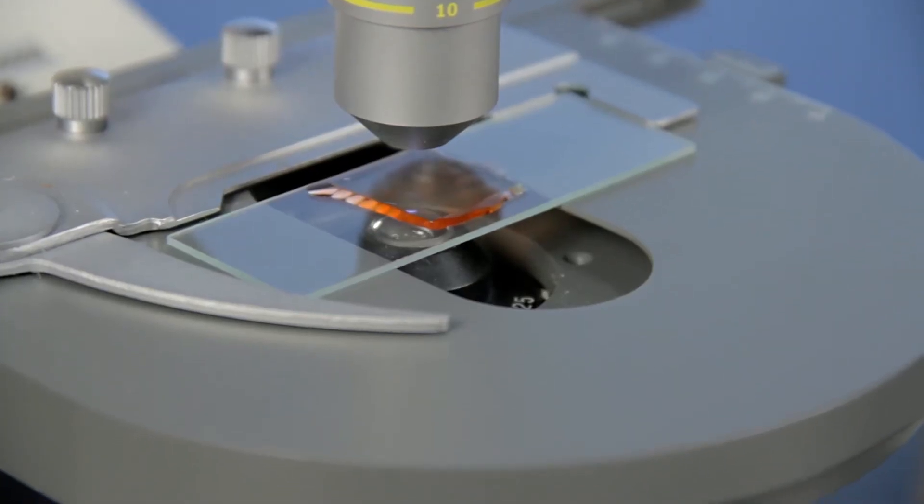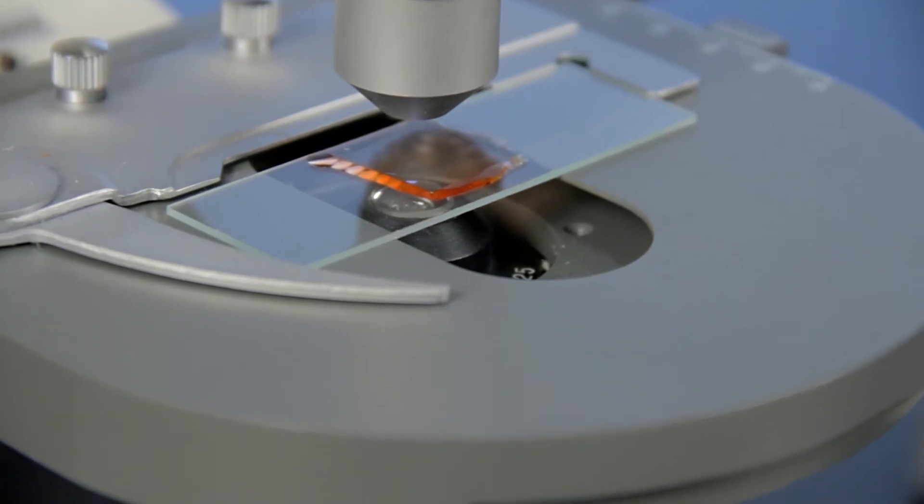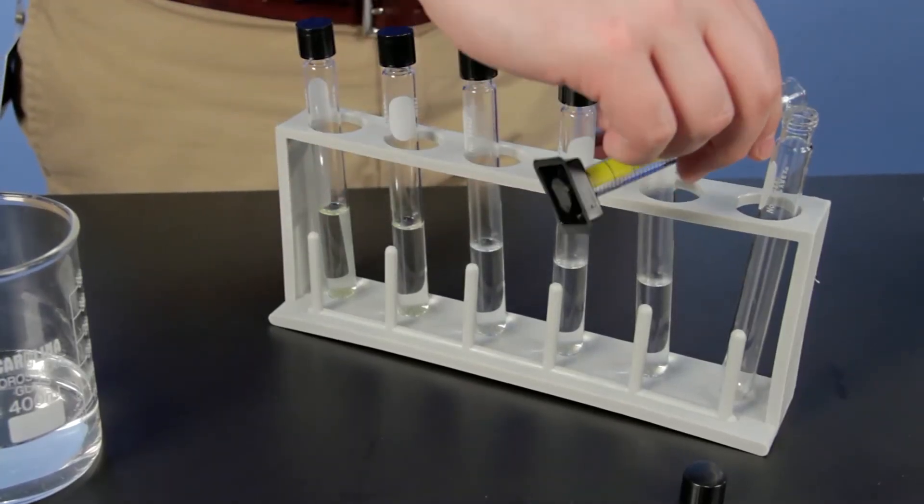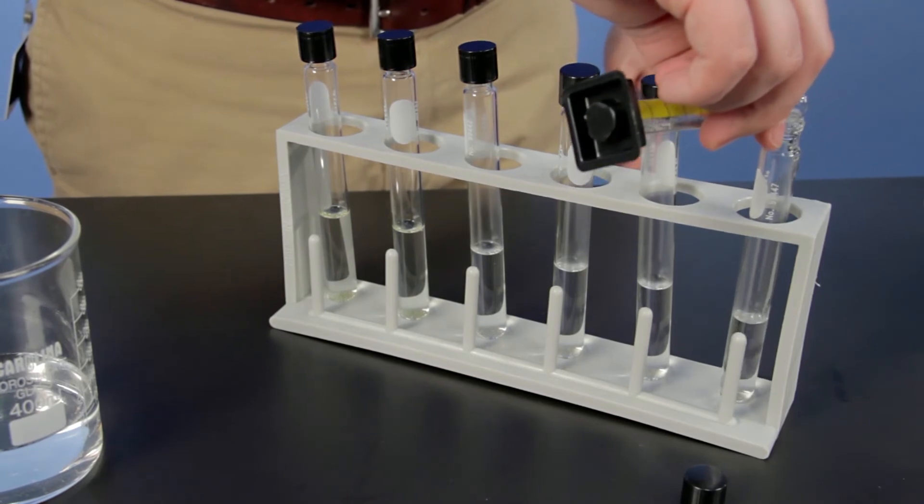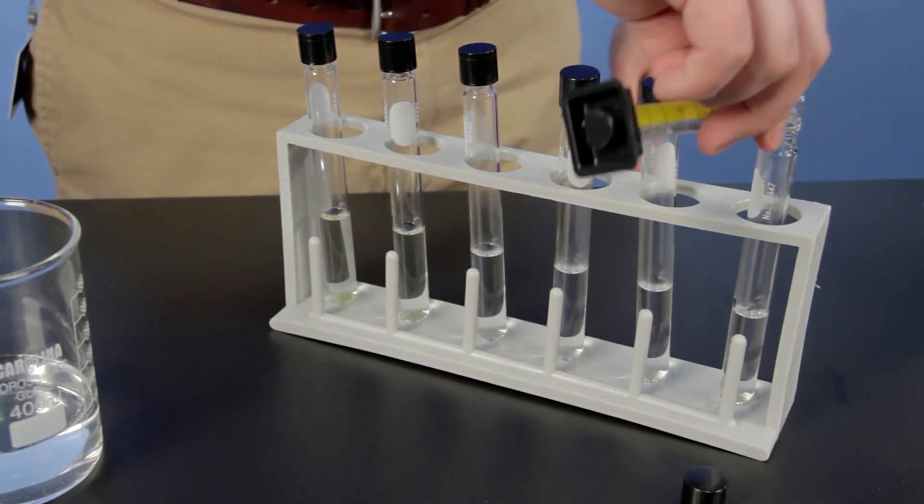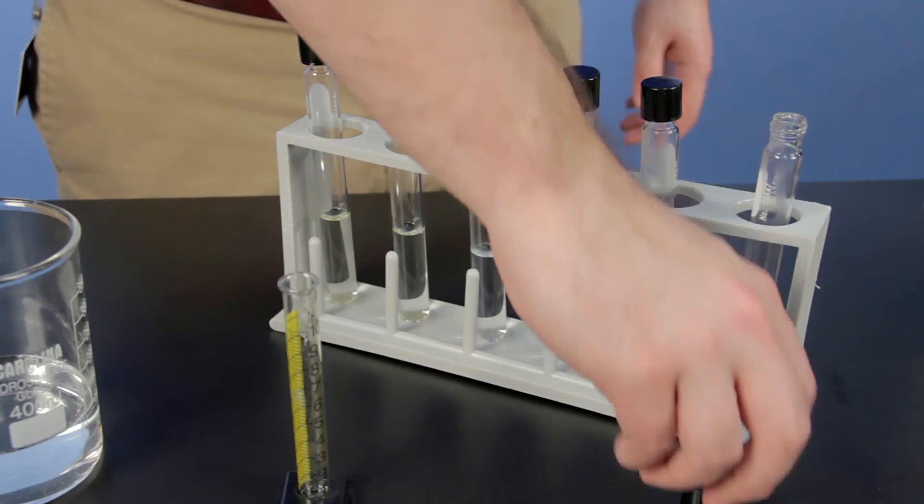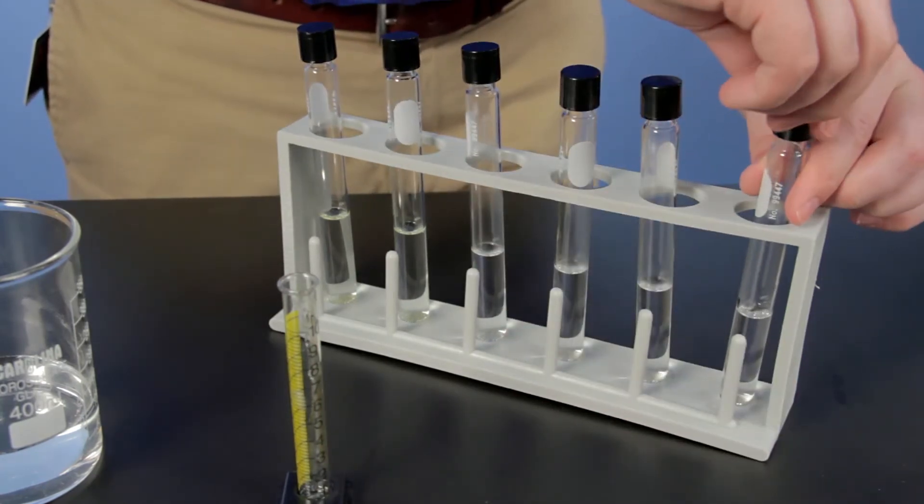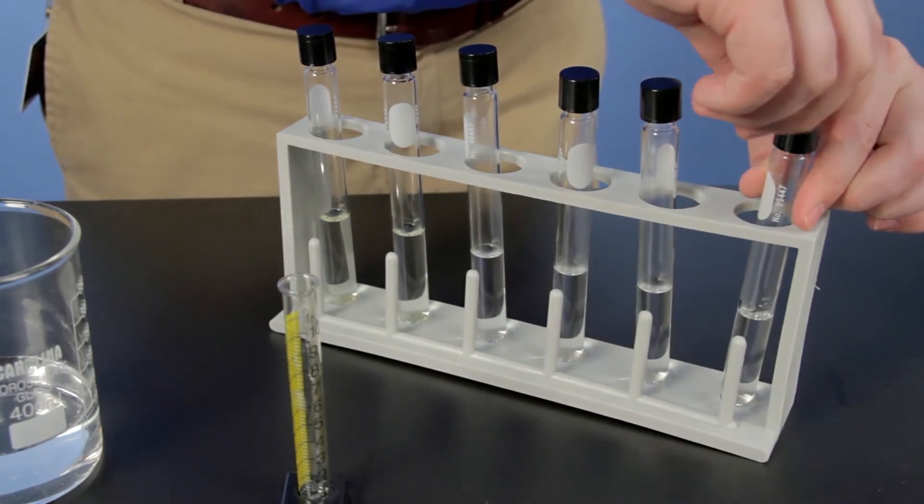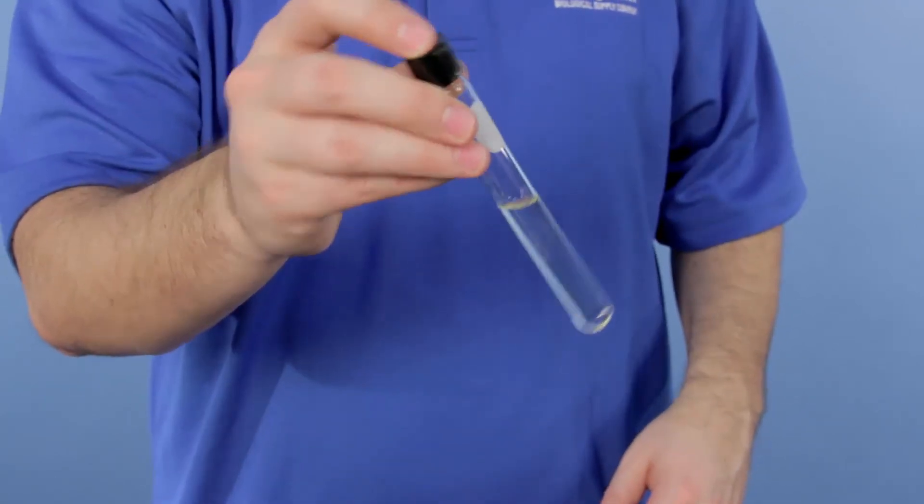Offering an inquiry-based approach to the origin of life, students work to replicate the work of Alexander Oparin from the 1920s by investigating the formation of coacervates. These coacervates are phospholipid vesicles that are believed to be created during the early formation of Earth and may have been a building block to life as we know it today.